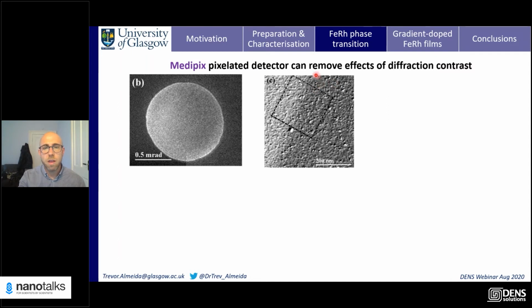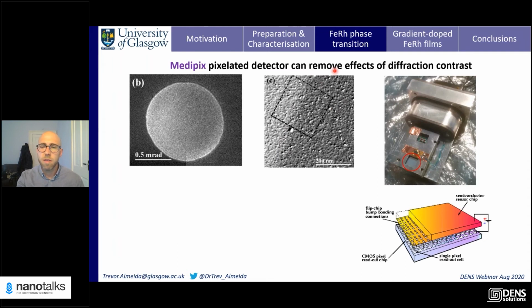And what we're trying to see here is we've actually got a domain wall present, but it's not very clear because of all the polycrystallinity. So to try and clean this up, we can use a pixelated detector, where essentially we have a 256 by 256 detector, and at each scan pixel, you can take an image of the beam.